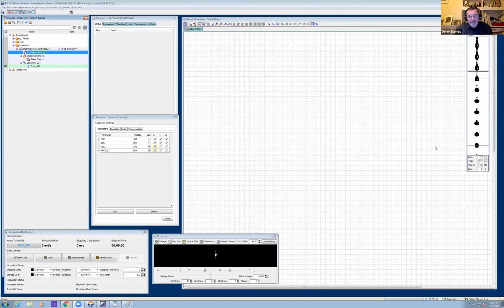The answer to that is no, really, because the electronics are constantly looking at that stream of cells and they're working out where they're going to be in each of those drops. So electronically, this is all happening very, very quickly. So there's no extra time involved in that. Well, maybe it's picoseconds. No, you're right. The decisions are being made all the time, regardless of the sort mode, right? If it's purity, yield, or whatever.